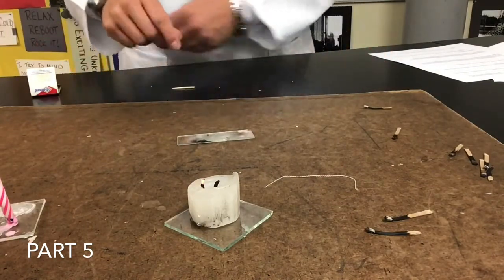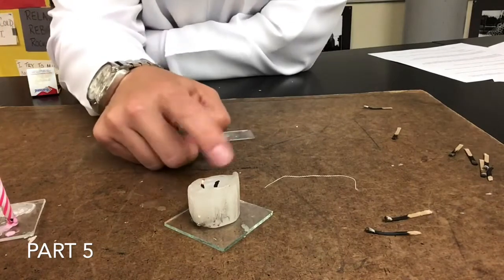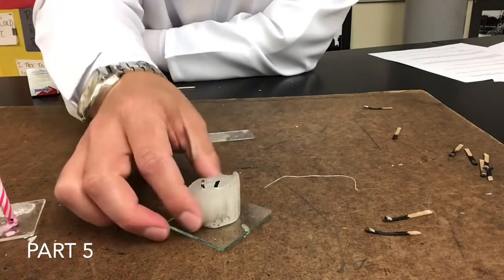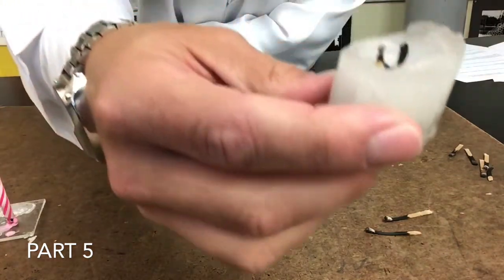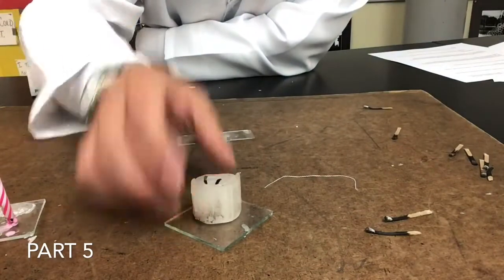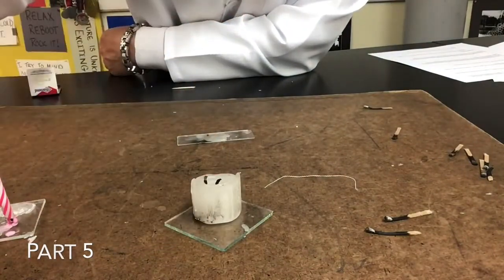But what you did was a controlled experiment. You made everything the same about this candle, but instead of using the traditional wick, you used that toothpick wick. And as you can see, the toothpick didn't burn very well. Okay, pause and write down your observations if you need to.